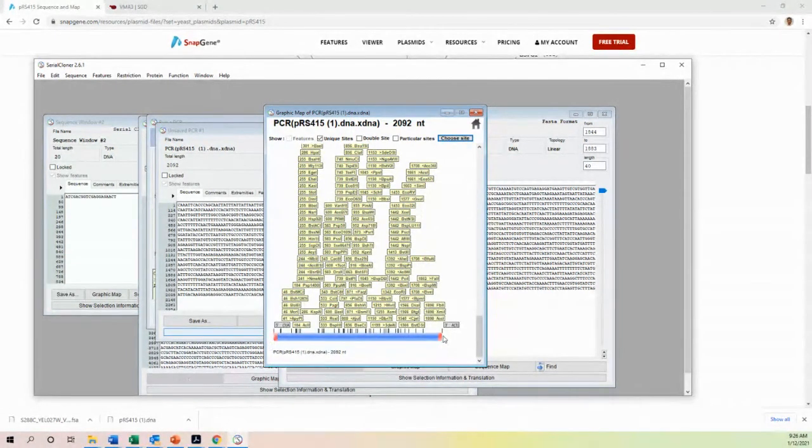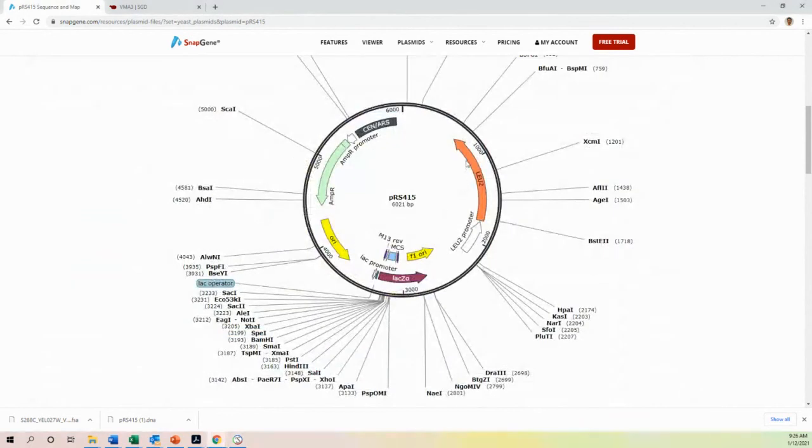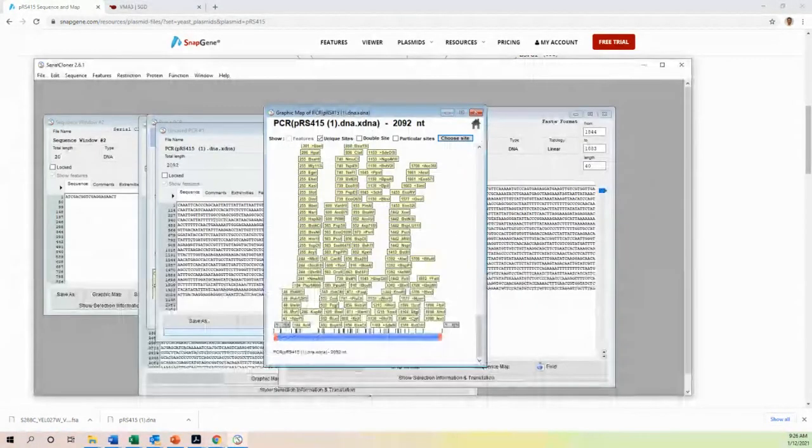These two red areas will find the VMA3 location and then perform the homologous recombination and replace the chromosome of VMA3, and then put in the insert, which is the LEU2, which is leucine. All right, any question about this project?